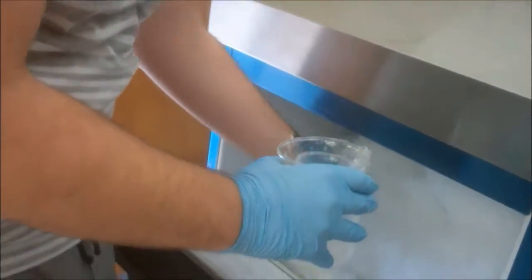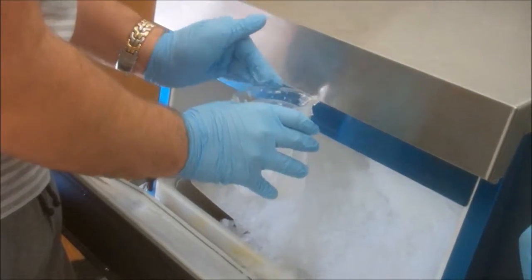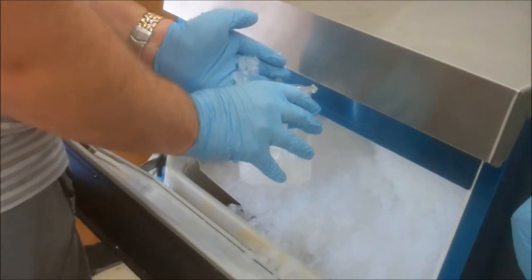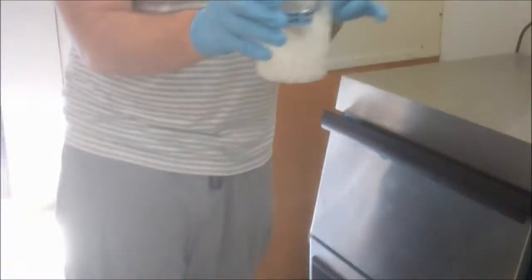We put the litmus in and it turned red, which means acidic. We had to bring it back to an acid, so you've got to bring it back to an acid. It gets hot, so you have to put it on ice.